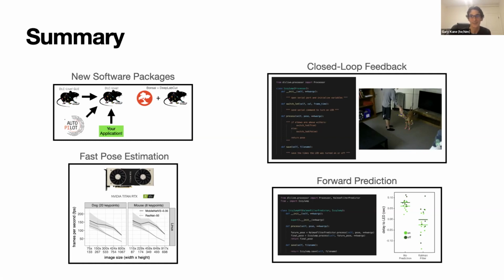But if your motor impaired animals exhibit some weird kinds of movements, so for example, when training this network to track Izzy, I had to label a ton of frames to get this to work successfully because there was just really huge variety in the frames. I have to label the entirety of a jump sequence, and I'm going to have to label that jump sequence in all different parts of the room, because if Izzy's facing in a different direction, then the configuration of these limbs is different. And so it's kind of a novel image for DeepLabCut. So I think you want to make sure that you're labeling one image from the whole complexity of the behaviors that you're going to capture.